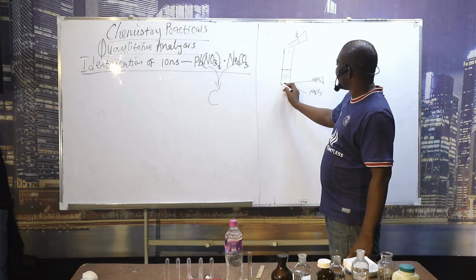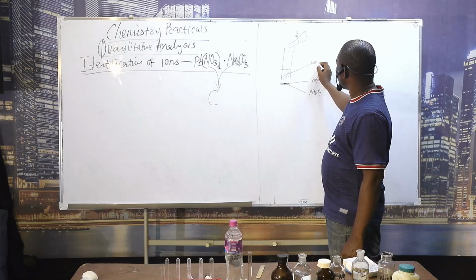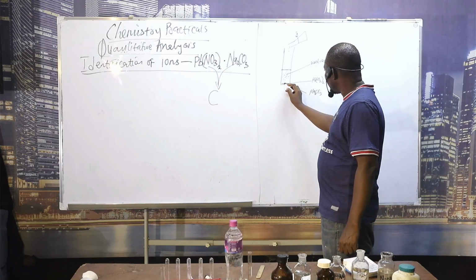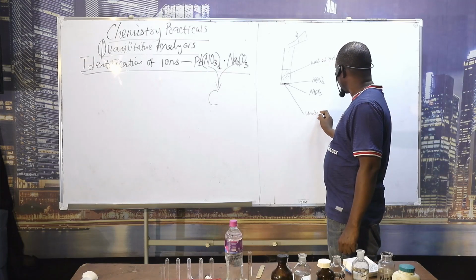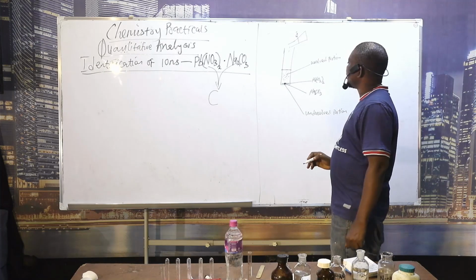Let's say half of the salt, since it's in the same ratio, has already dissolved here. So this is the dissolved portion, and we're going to find out what portion just dissolved. Then this is the undissolved portion. Okay, let's see what is going to be there.